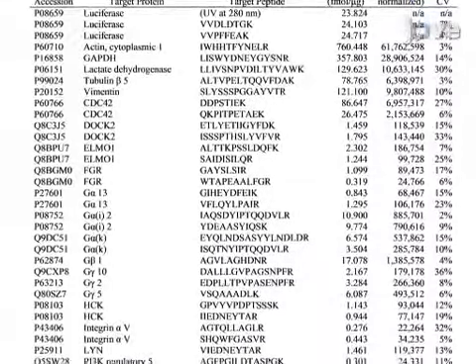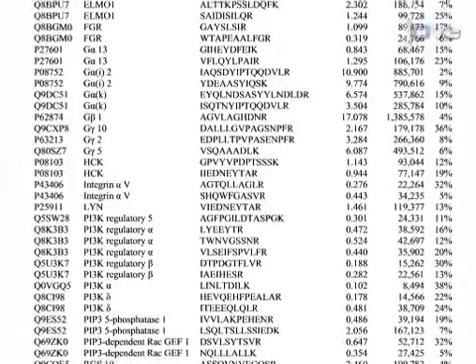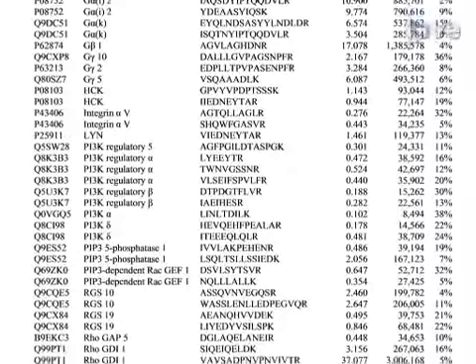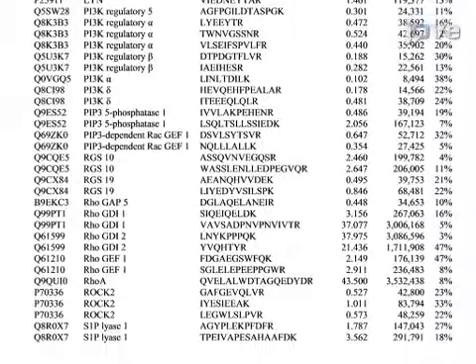Ultimately, LC-SRM can be used to accurately quantify proteins from a wide variety of biological samples and to support investigations of a wide variety of protein targets. The main advantage of this technique over existing methods, like immunoassays, is that the assay development is relatively quick and inexpensive, and the resulting assays are amenable to multiplexing and not vulnerable to antibody cross-reactivity.